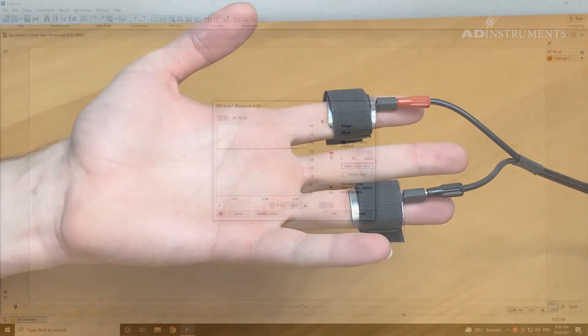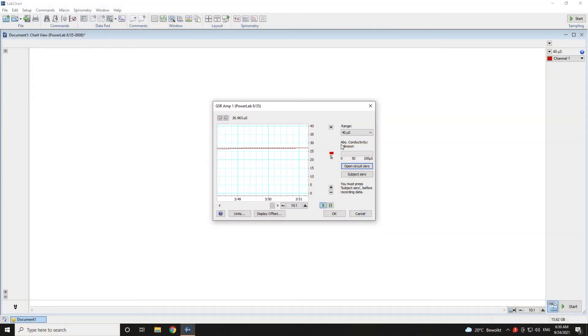After the electrodes have been allowed to equilibrate for a couple of minutes, click on subject zero to zero the signal for this particular subject.